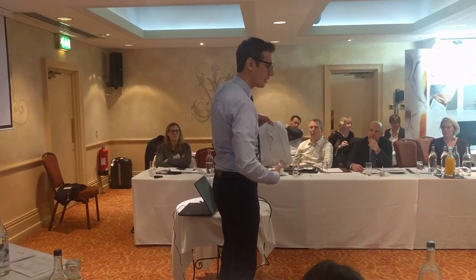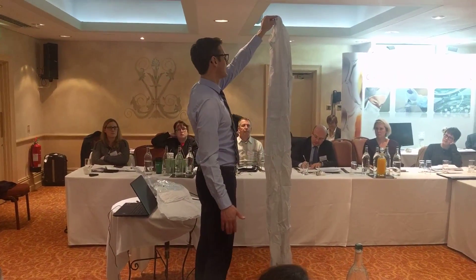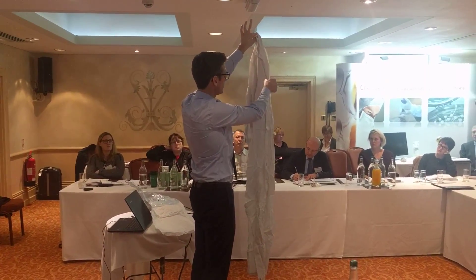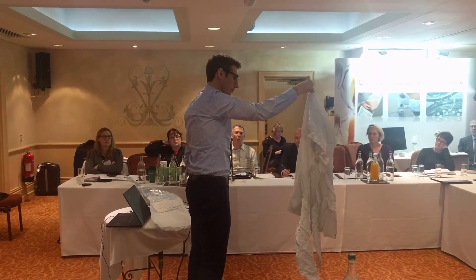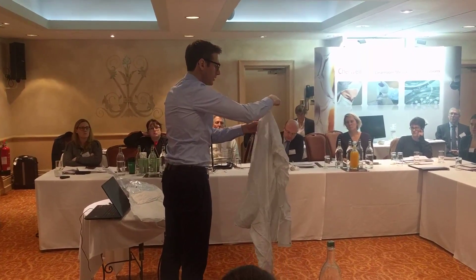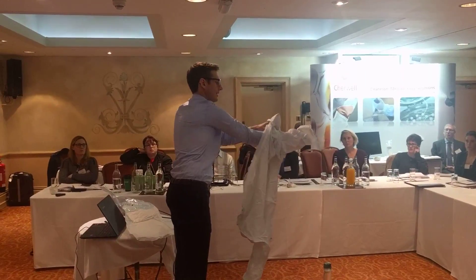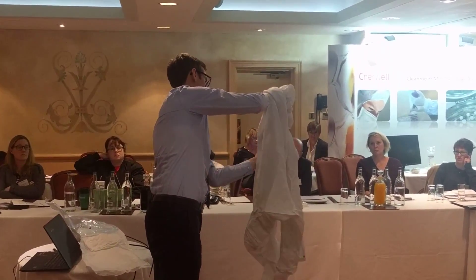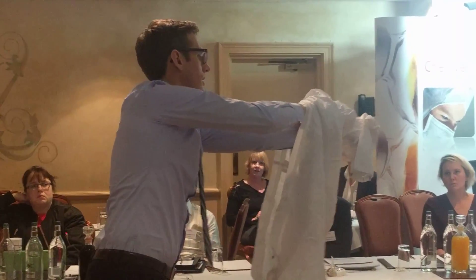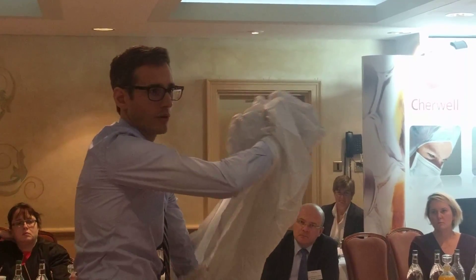Then we have the first challenge if the suit is large — it's very long and it's closed. So we try to open the zipper without contact on the rest of the overall. I take the overall on the inside, grab my right leg so I get inside the overall, and collect the material. Take care that the outside doesn't turn inside. Grab the left leg — we also call it overall origami.